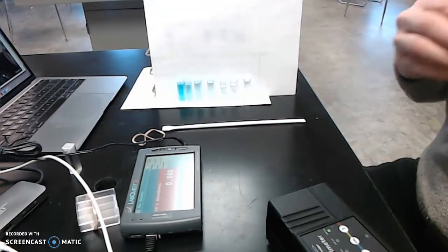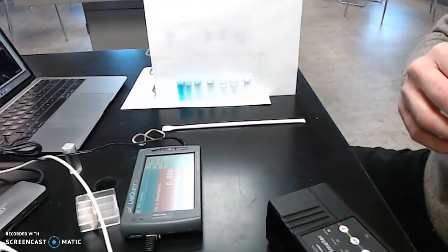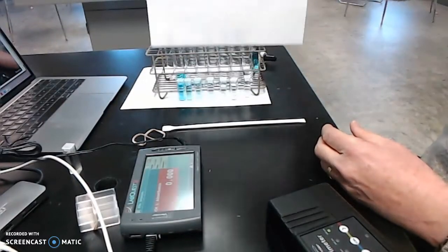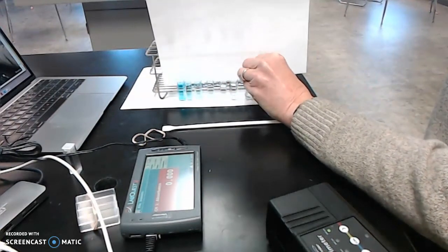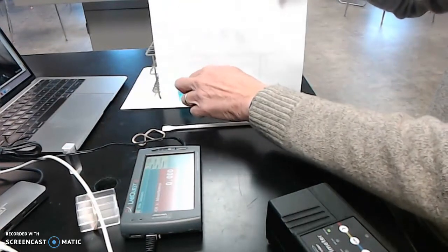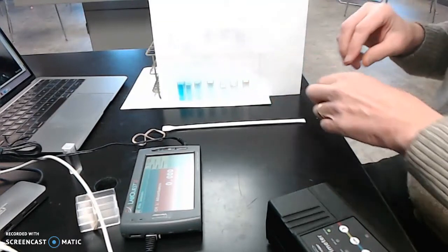I know Mr. Sandin was using it for the lichen lab, and I'm going to go into just a little bit more detail so that you can see how the equipment is working. So here are my cuvettes. They came from these test tubes that I showed you in the pre-lab video. These are the cuvettes that have the various dilutions of the copper chloride solution. And over here is the 50,000 parts per million, and down here is the least concentrated.